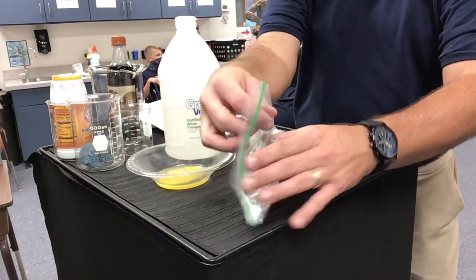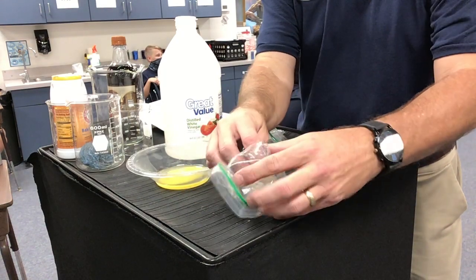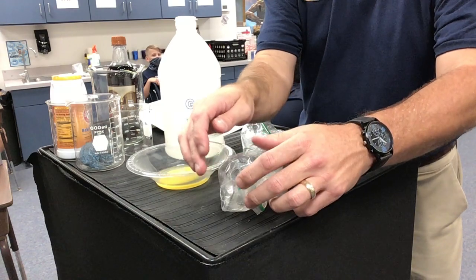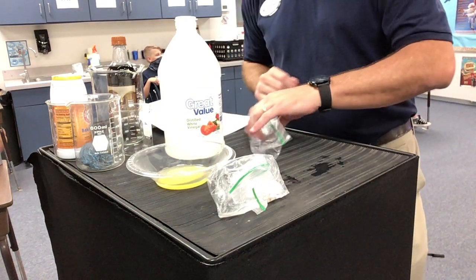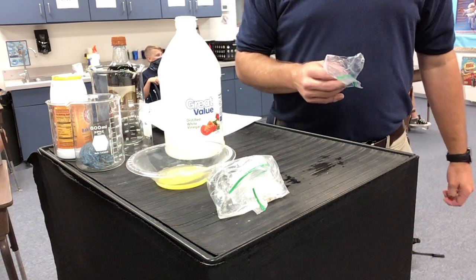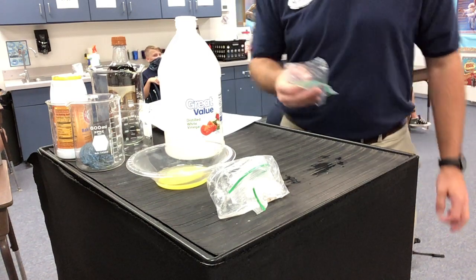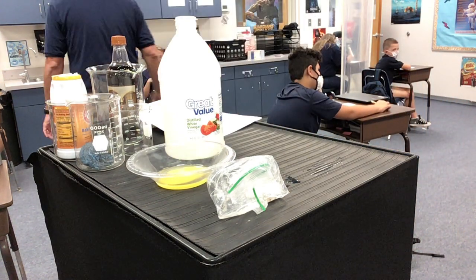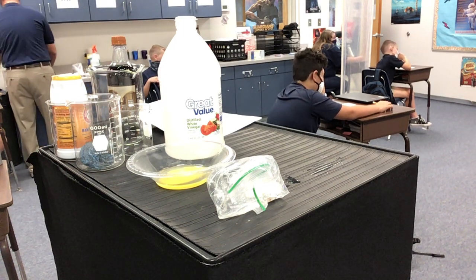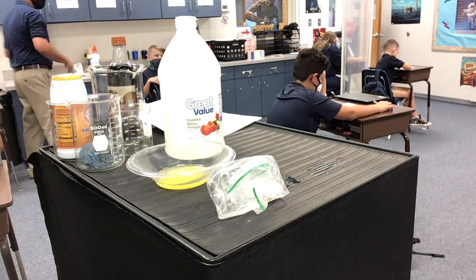For a little bit and see if you guys can see any kind of a color change or bubbles. How do we know if it's an odor change? I'm going to tell you right now, there is not an odor change. All you're going to smell is vinegar, okay? So there is no odor change. And I'll also tell you, there is no temperature change. Okay, it's not getting any hotter or colder.